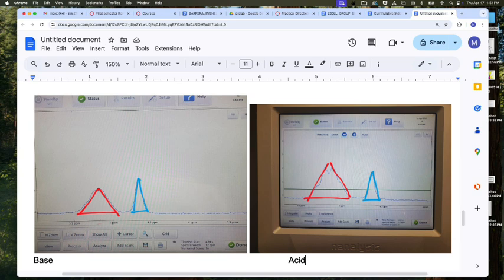So I'm going to shout out some numbers. We need some people taking some stuff down. For our base, 5.2. We're looking at a base 23. Height, 13.5. And if we were being nice to each other, someone could run the calculations so that we could summarize them on the board so that you would have this information for a post lab.